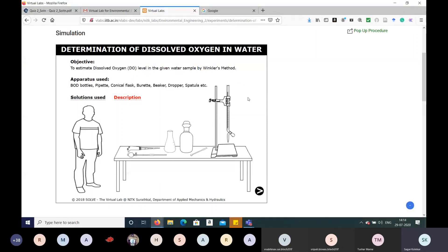The objective of this experiment is to estimate dissolved oxygen in a given water sample — we'll use a wastewater sample to find out the DO level. The apparatus required include: a BOD bottle, pipette, conical flask, beaker, dropper, and spatula.